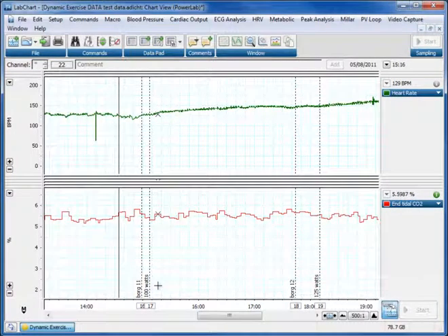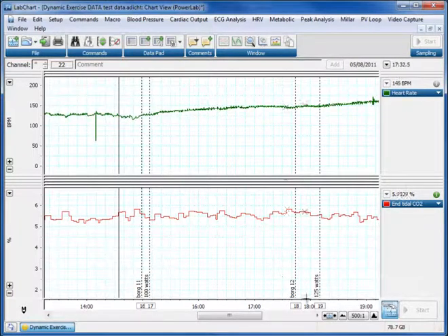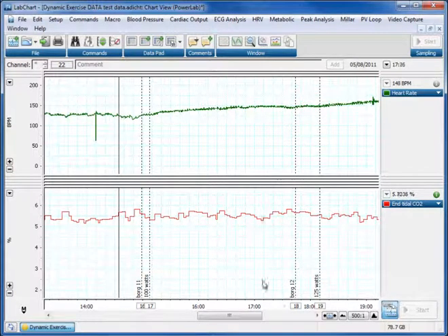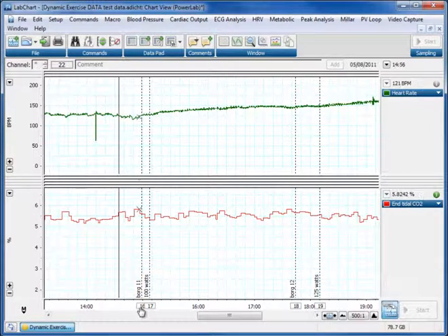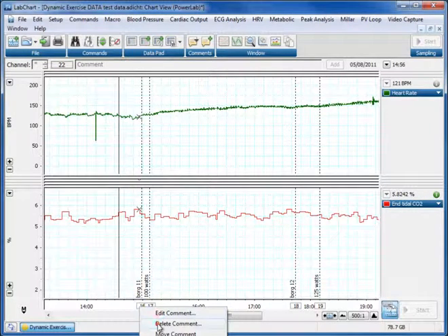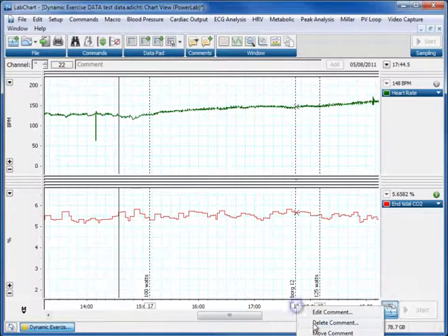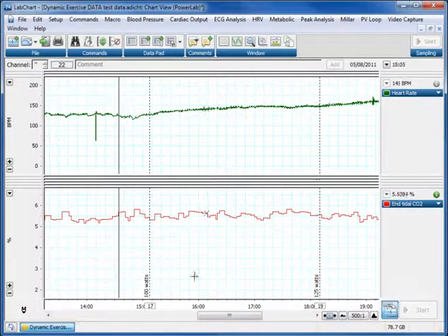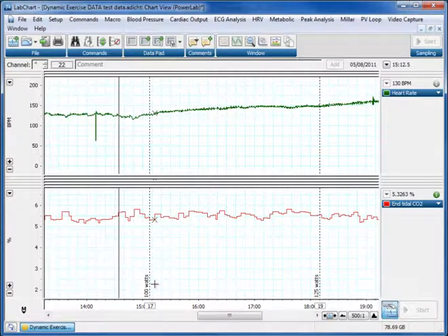What we don't want, however, is some of the extraneous data we've got here. We've got some Borg readings - ratings of how hard the person was working. So these are Borgs. I can get rid of those. I can right click and choose delete comment, and say yes. Delete that comment, and say yes. I want to leave these two comments in because they're going to be useful for scaling later.